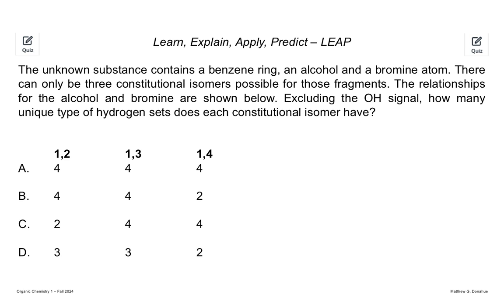And so I'm gonna just tell you the C6 belongs to a benzene ring. So that's benzene. There was an alcohol, we figured that out from the IR. And there was a bromine, we figured that out from the mass spec. There were 6 carbons, and then we figured out from the proton there were 4 signals. The ratios were all 1-to-1 to 1-to-1.